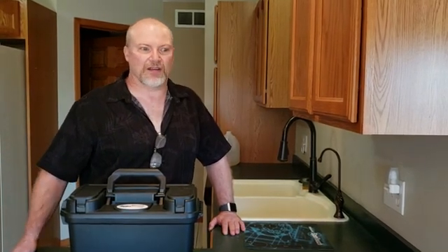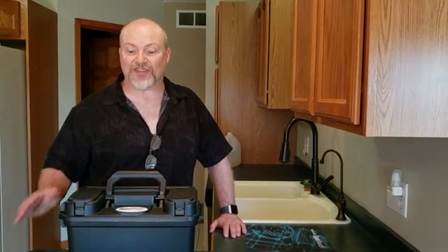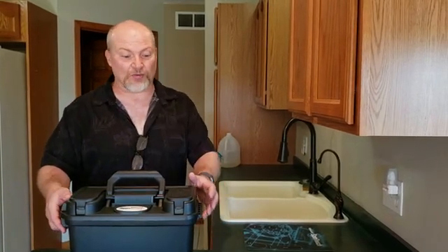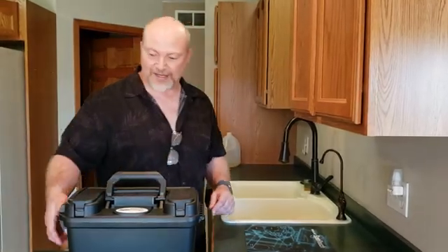I've had the home tested for nitrates and it's been usually non-detectable, but this also tests for nitrates and gives me a reading there. I'm very curious to see how this plays out. Let's see how this works.